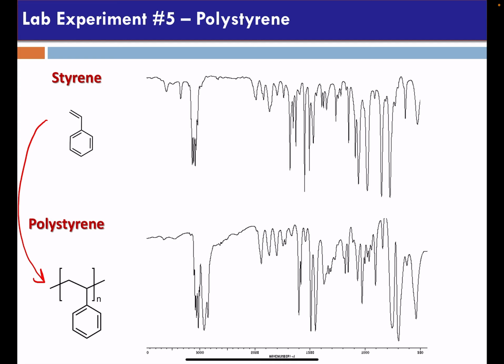So to help with that, we identify a functional group here that has C double bond C, so looking for unique C double bond C features that are different than those that are in the aromatics, which are more like a C bond and a half C. And so the carbon-carbon double bond properly of the vinyl group in styrene monomer should be at higher wave number than that of the bond and a half in the benzene.